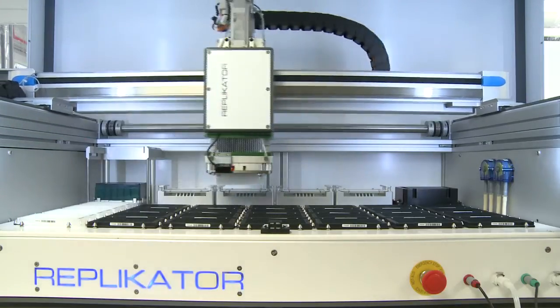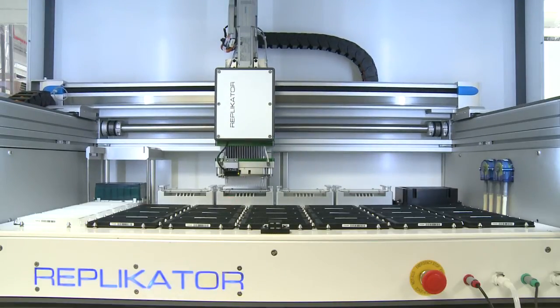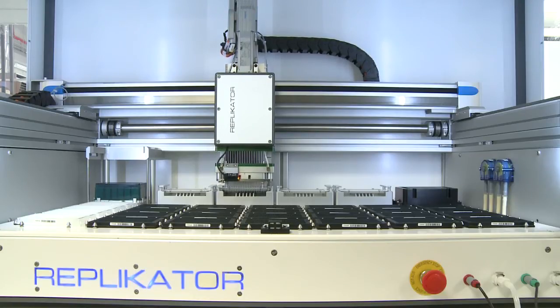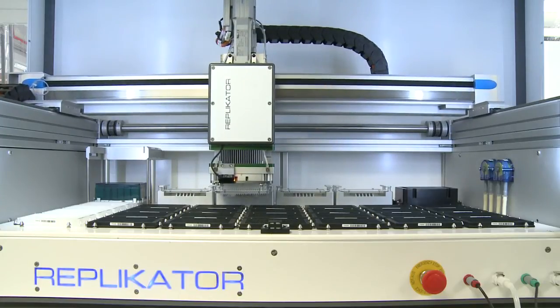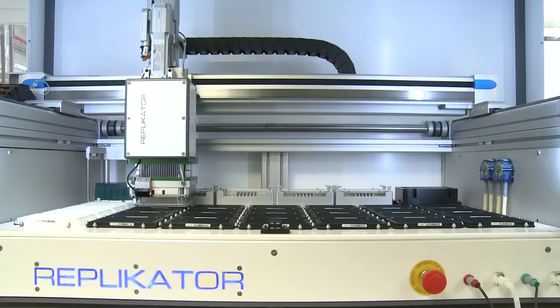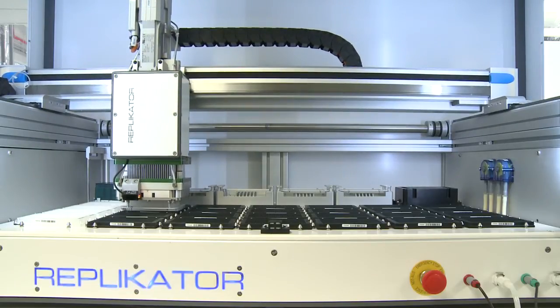Replicator complements the way you work and enhances your laboratory's capacity. Replicator is also LIMS compatible, allowing you to track all of your precious samples and where they go. Replicator can be preset to perform the operations that you do the most, so it's ready to work out of the box. Spend less time moving liquids and more time with your results.